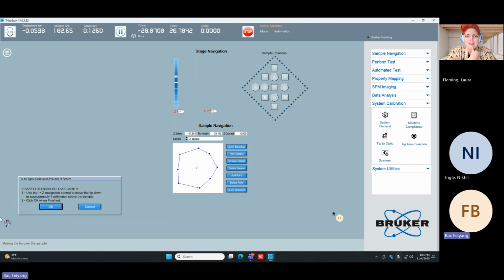Yes. So on this, I'm going to drive it down and drive the tip closer. And another thing, you see this button, it seems like sometimes I have to choose it to move it, but sometimes, like what I just did, I didn't. Yep, there's some nuance there. Let's get the tip going and then I can explain.